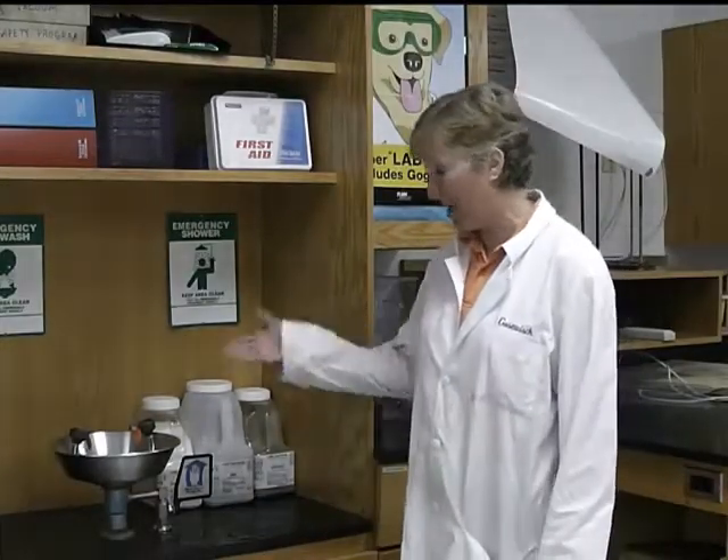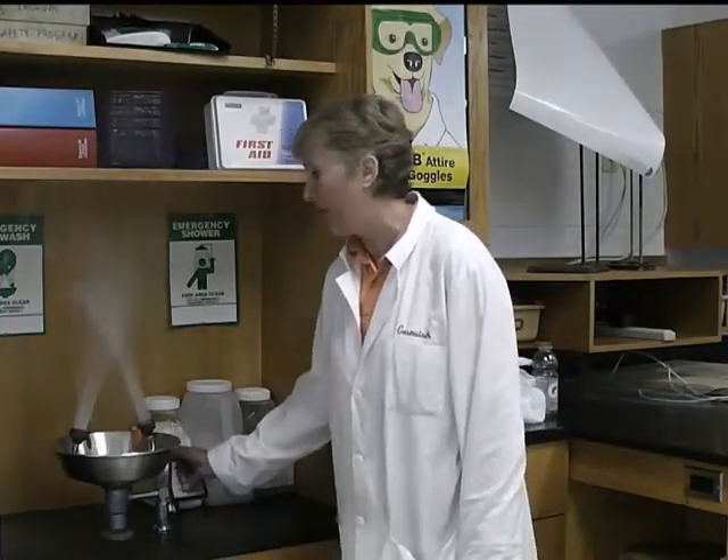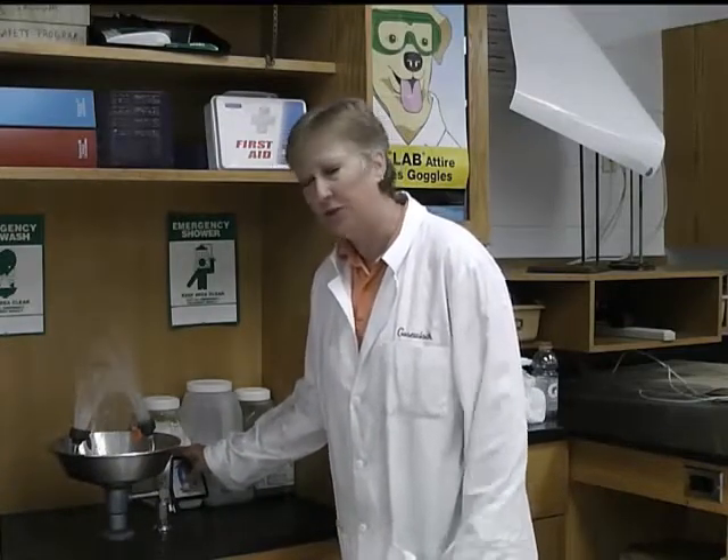Also where the shower is located, you have the eyewash. You should not have to use the eyewash at all because your instructor will walk through the room during the lab and basically kick you out if you do not have your goggles on. But just in case there's an incident where something gets into your eye, you come over to the eyewash station, push it back, and you get awfully wet. You've got to get your face and your eyes in there to wash them out. If you are a contact lens wearer, you have to open your eyes really wide so that the water actually washes the lenses out of your eye — because you can always buy another pair of contact lenses, but you cannot buy another pair of eyeballs. Really open wide so those contact lenses get out of your eyes, otherwise they're going to melt onto them.